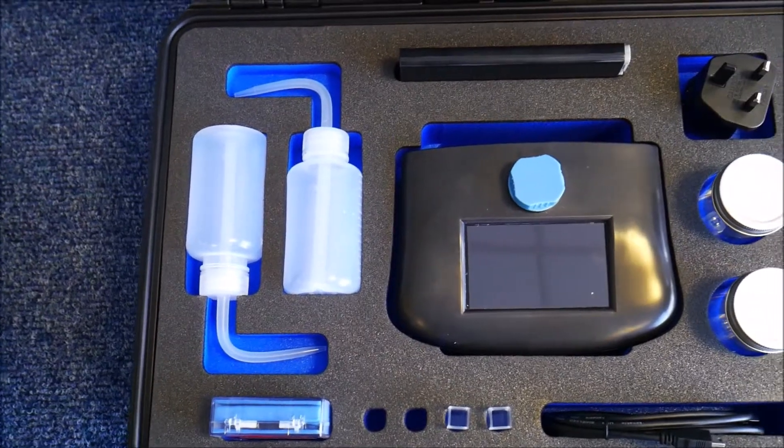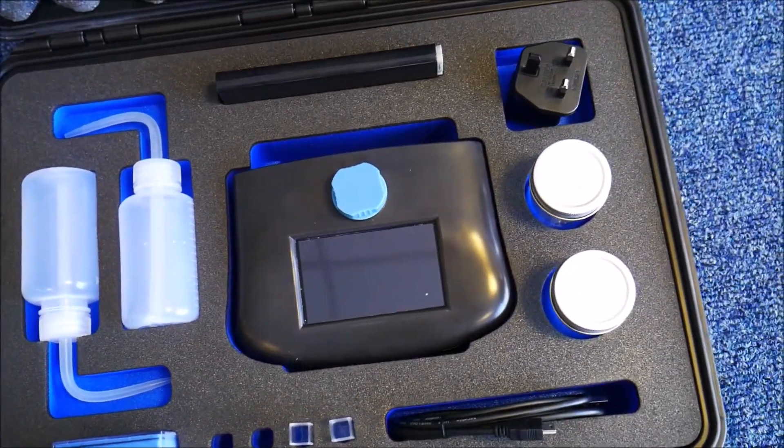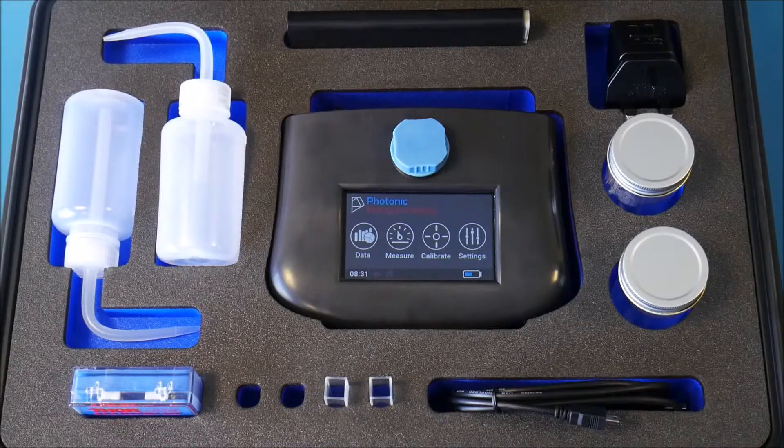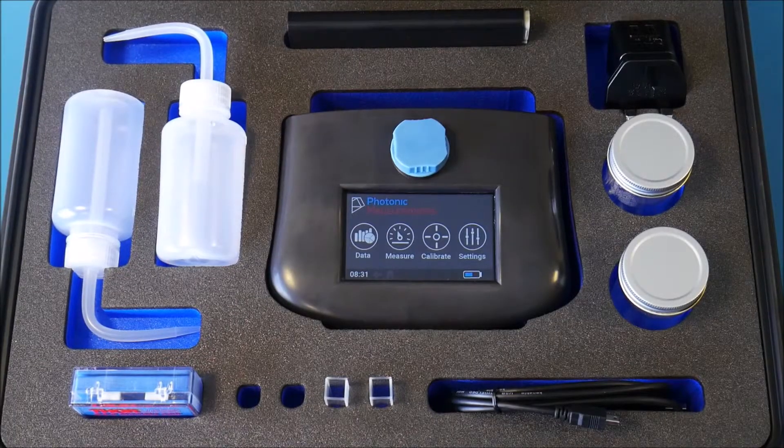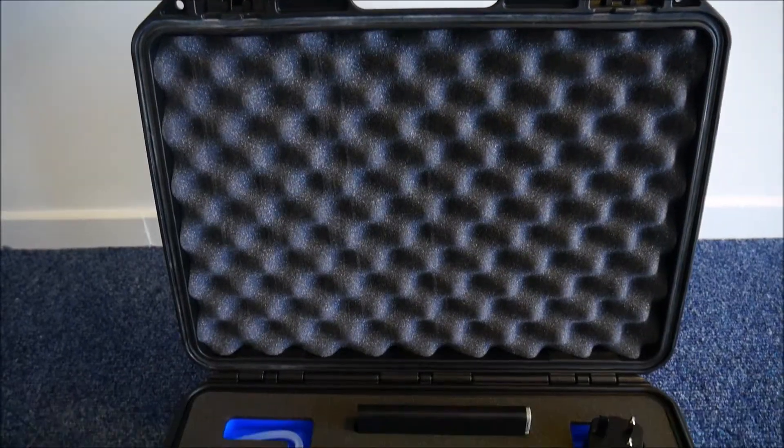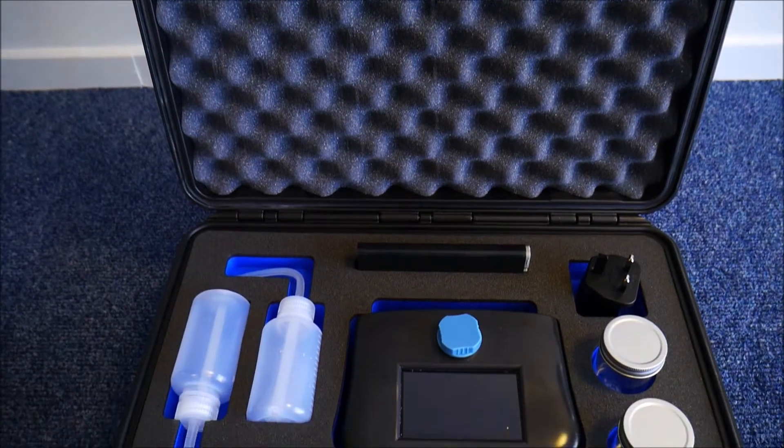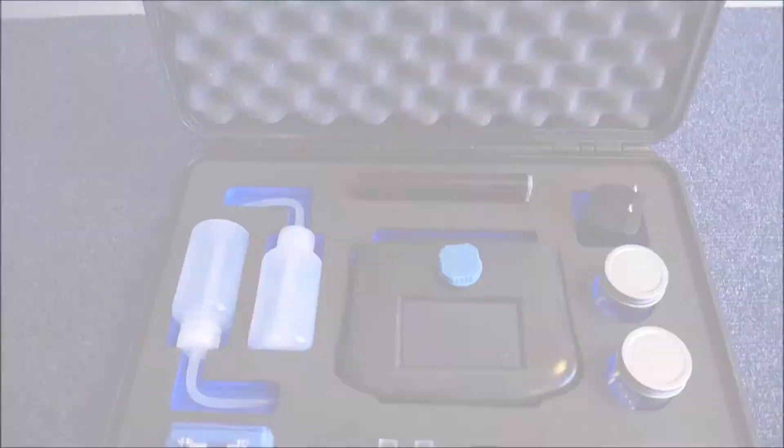Included in the GO case is two sample dispensers, one charger, one battery bank, one box of cuvettes, two sample containers and one USB cable for exporting data.